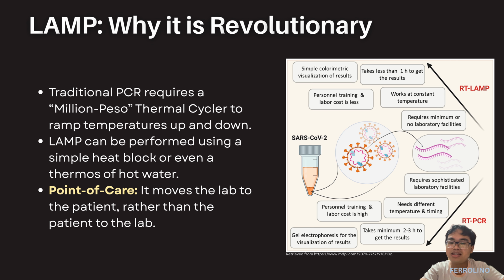The LAMP eliminates this thermal lag. Because the BST polymerase performs strand displacement and synthesis simultaneously at a constant temperature, the reaction enters an autocycling phase. This then leads to a higher rate of DNA accumulation, where the LAMP can achieve billions of copies of the target sequence in 15 to 60 minutes, whereas PCR typically requires 90 to 120 minutes for a similar yield.